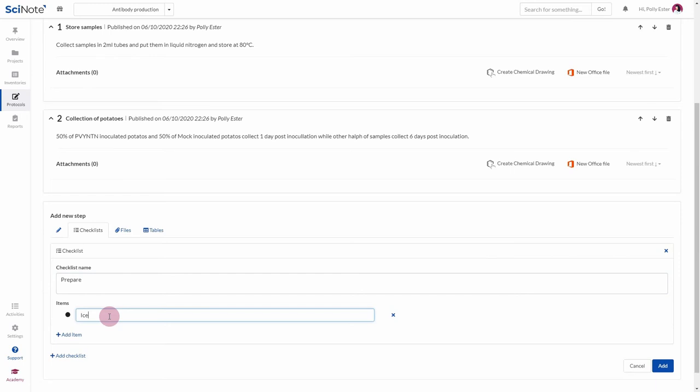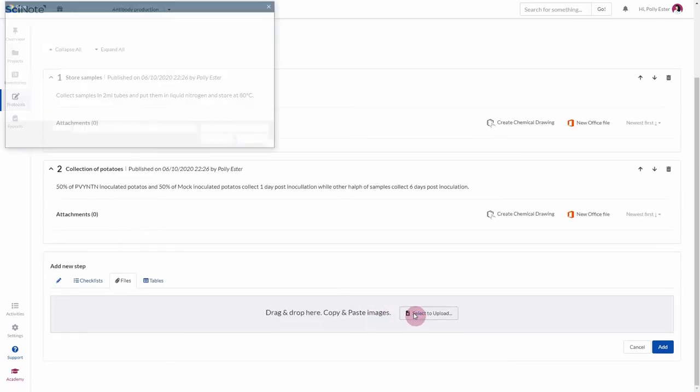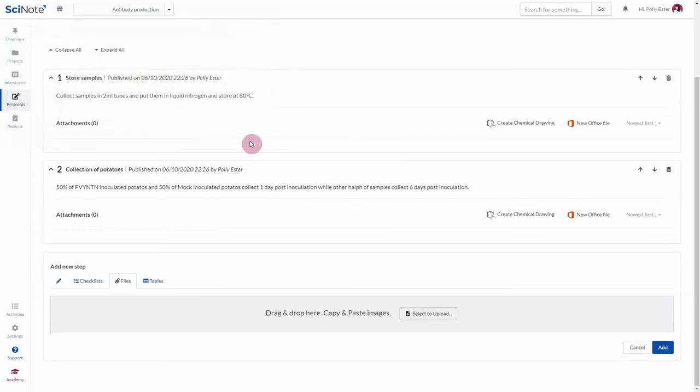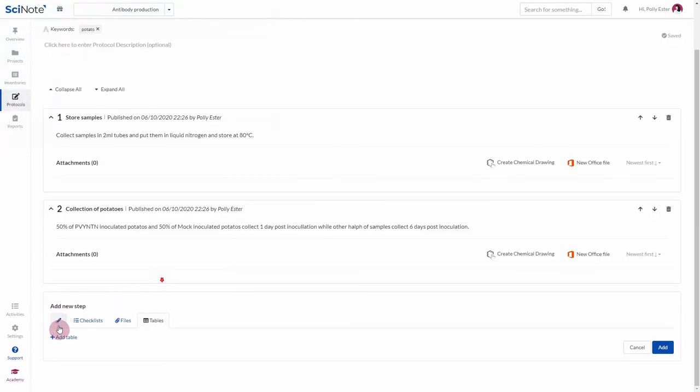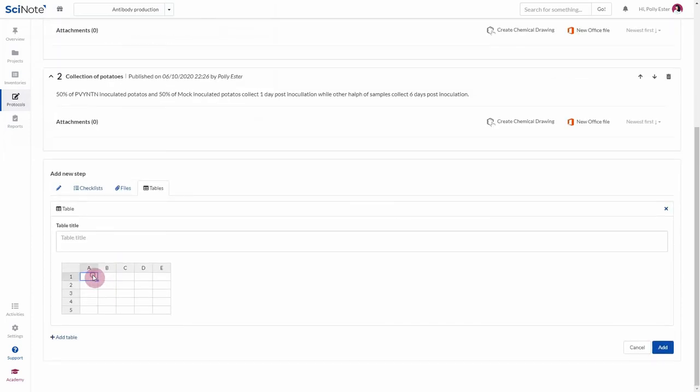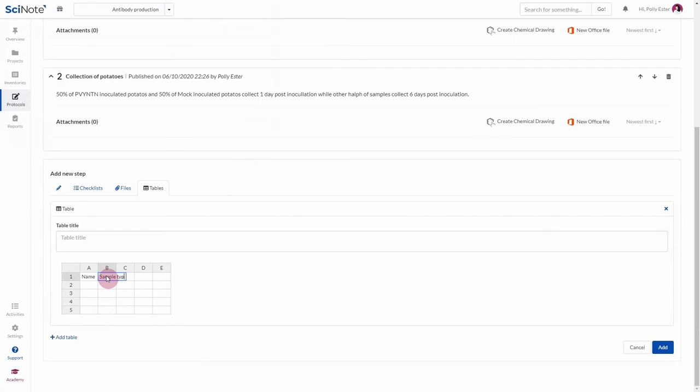To add files, you can either simply drag and drop the file or you can select to upload from your computer. You can upload any file type to SciNote. Let's also add a table. The tables also support some formulas. You can add several tables to a step.